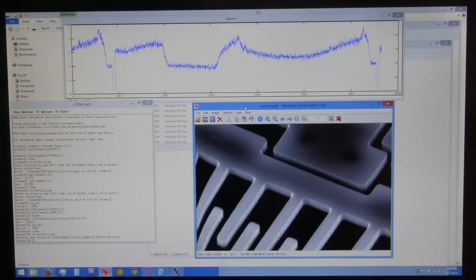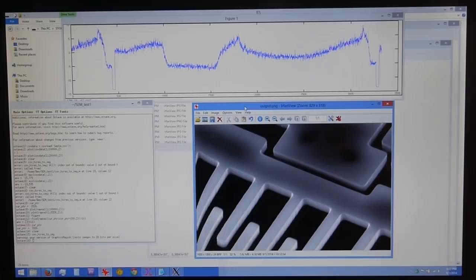I'm using Octave, which is an open source MATLAB alternative to take the data in the CSV file and produce an image. So here you can see the horizontal pulses in the raw data. This represents one scan line. And my script just goes through and puts those scan lines together, filling up the image in sort of a raster pattern.